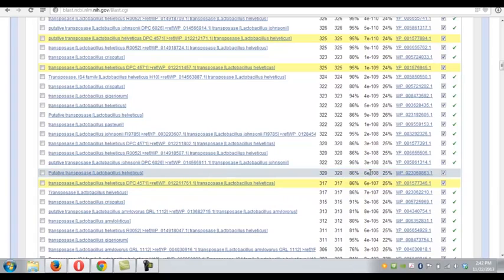But let's remember, in the second iteration, we're not running the query sequence from Pyrococcus. We're now running a PSSM that represents both the Pyrococcus sequence and a bunch of other transposases. So these E values say that the PSSM was matched very, very well, which suggests that it's probably a member of that protein family.